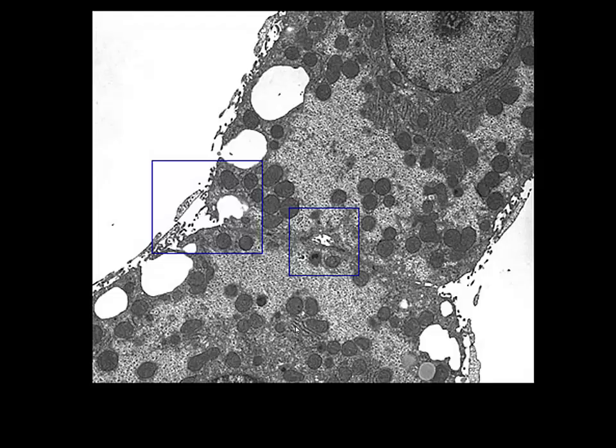Now as we look at some electron micrographs of liver, it would be fairly easy for you to recognize these particular cells because here on these lateral borders we have our bile canaliculus, the tight fascia occludens junctions between these 2 hepatocytes. Here we have our sinusoidal endothelium, hepatic sinusoid, and then we have our space of Disse filled with hepatic microvilli.